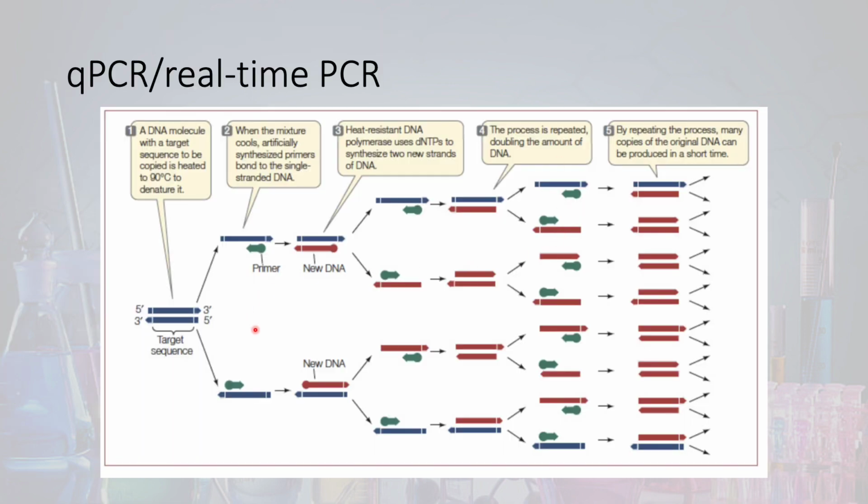And to add another cartoon, just in case you've been looking at this cartoon infographic, you can see primers right here in green. Here's the first or second cycle in PCR, and as you can see, these primers prime the synthesis of new DNA strands. Another cycle repeats, more primers come in, more DNA is synthesized, and this process repeats over and over and over. So these little green guys here are what we're designing this week, and we'll utilize them in a few weeks.